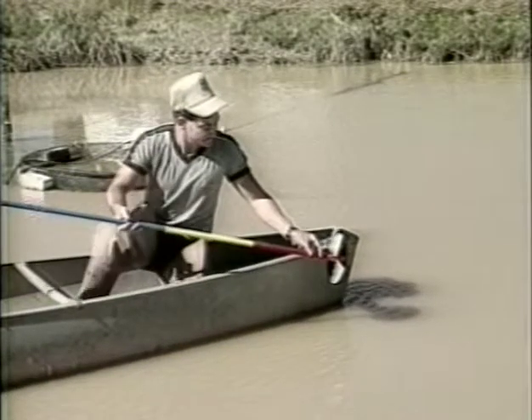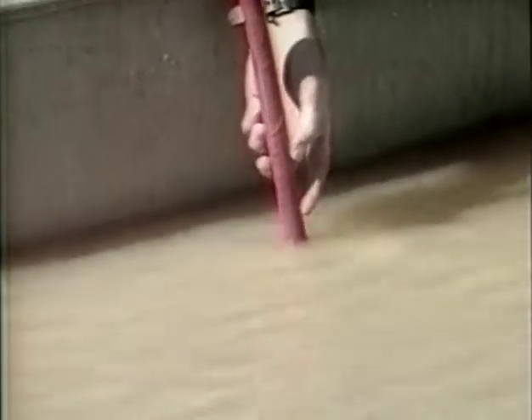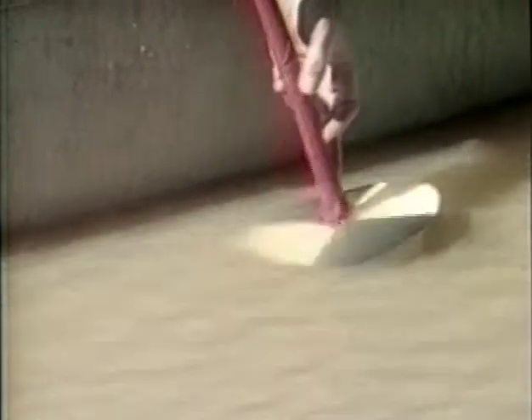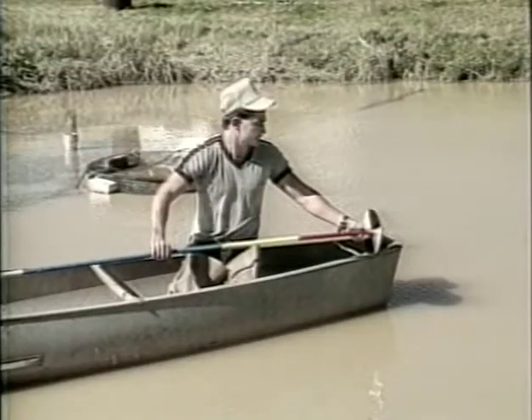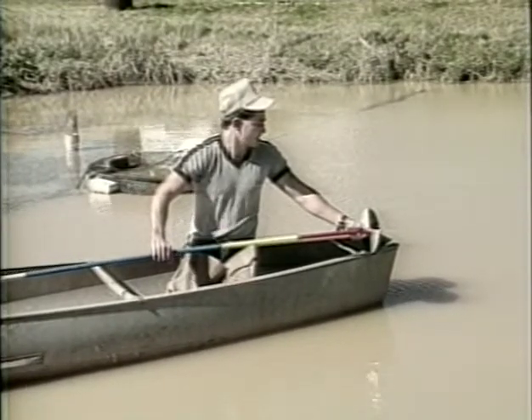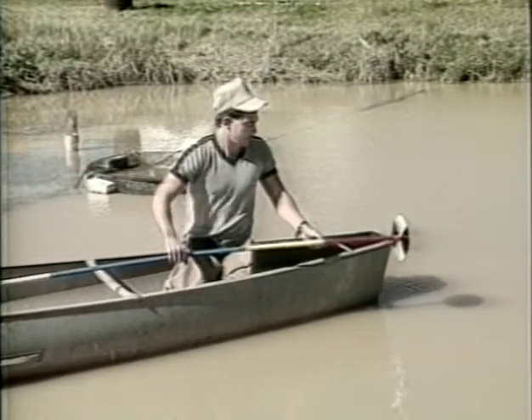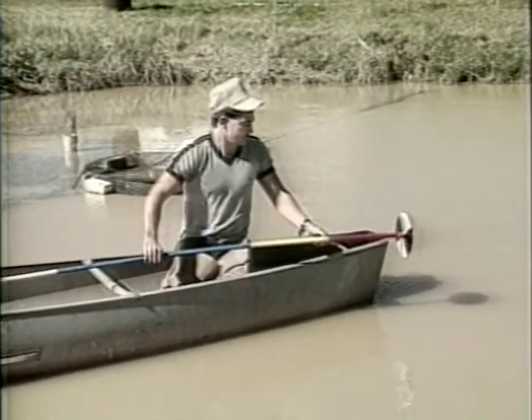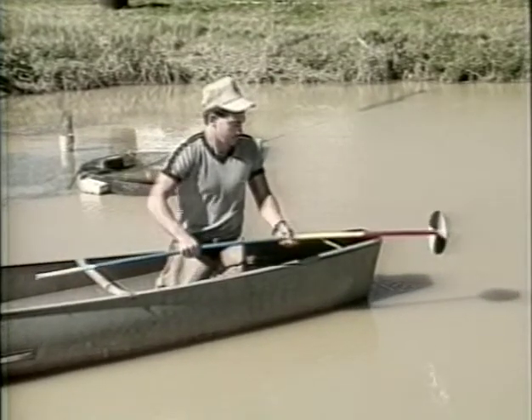Economically speaking, the practical choice for most pond owners is the use of a Secchi disc. The Secchi disc is a circular object roughly 20 centimeters in diameter, constructed of metal or plastic, which is divided by black and white quadrants. It is suspended by a rod or a rope, which is marked in gradations of inches or centimeters. A weight is usually present at the bottom of the disc to ensure its sinkage. Secchi discs may be purchased from scientific supply houses, or they can be easily made.